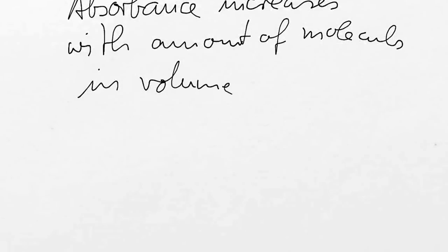I can say absorbance increases with the amount of molecules in the volume, in the given container. Wait a moment. We said amount per volume. What do we call that? Amount per volume. What is that?